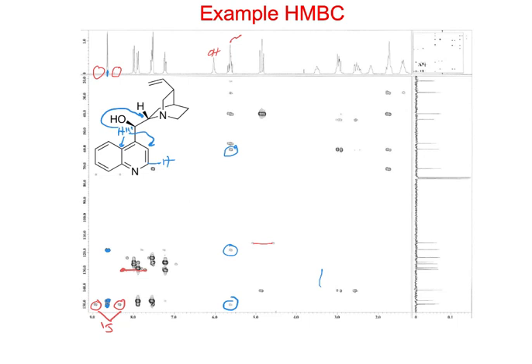It doesn't couple to the proton of the hydroxyl group? Not usually, right? Just to the carbon? Yeah, the proton on the alcohols just don't show much coupling because they're exchanging. And that's why they're usually just kind of broad. Sometimes you can see it, but if we look off of this and we look down from there, we see that there's no coupling showing up there.